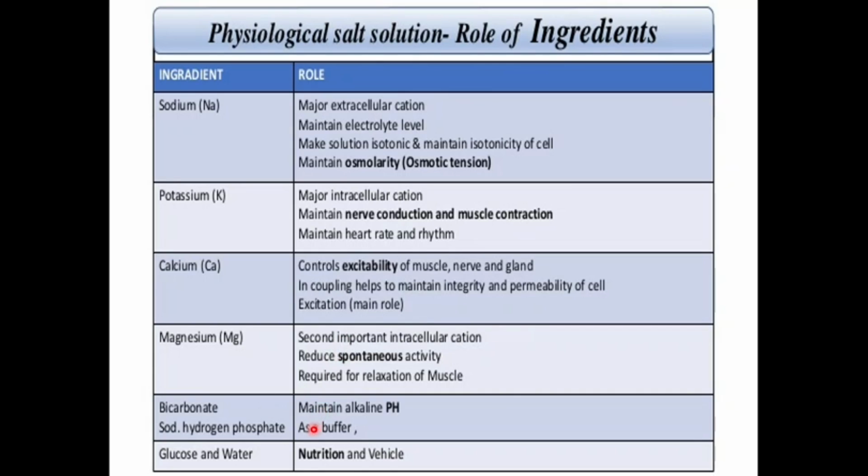The bicarbonate and the sodium hydrogen phosphate are added to maintain the buffer, or to maintain the pH of the physiological salt solution. And the glucose and water are given to maintain the nutrition and act as the vehicle. So you can see that these are all the constituents of the physiological salt solution.